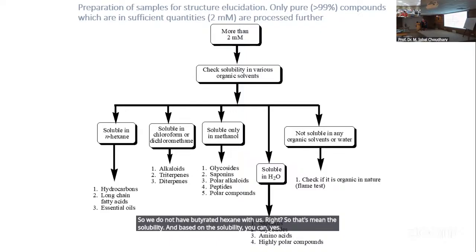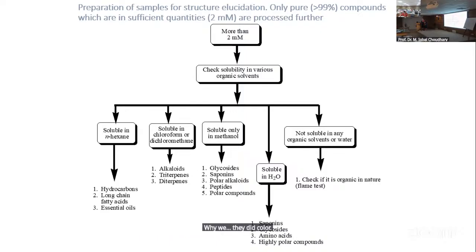Why do we use deuterated solvent? So far you have studied that there is a big magnet, right? And you are giving radio frequency.